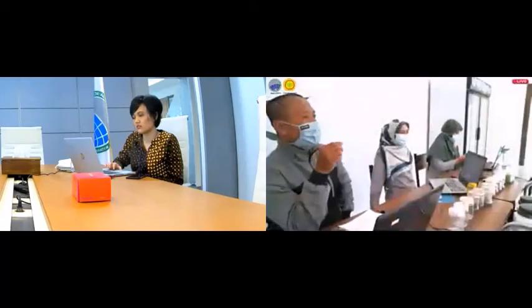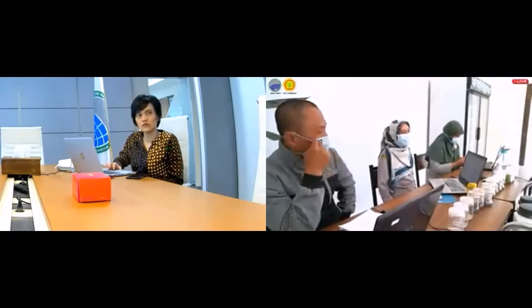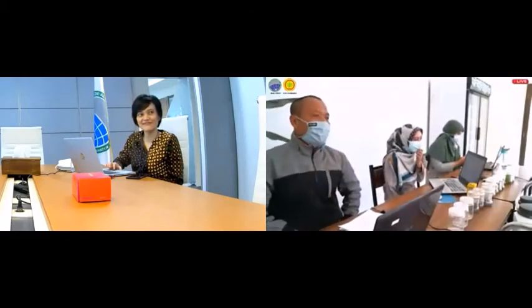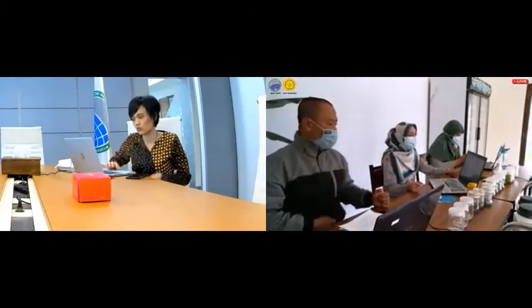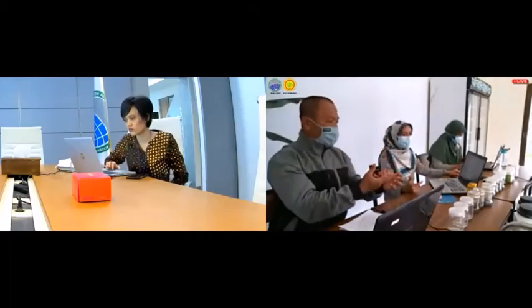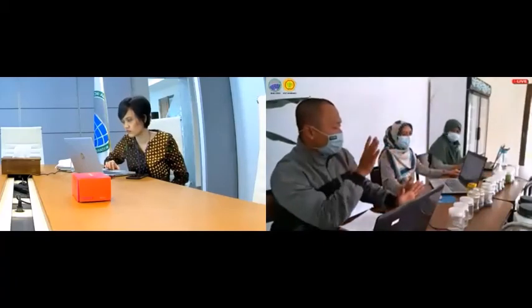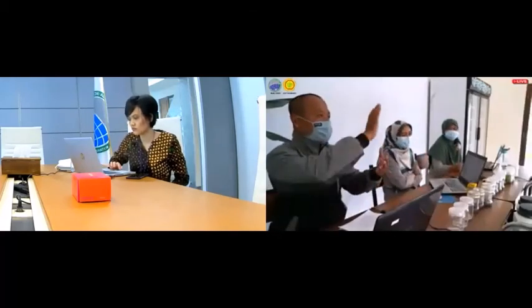I suggest you try and error. Try and learn, because our condition is different. About orchid explants, based on our experience, we just spray the orchid fruit on the skin.